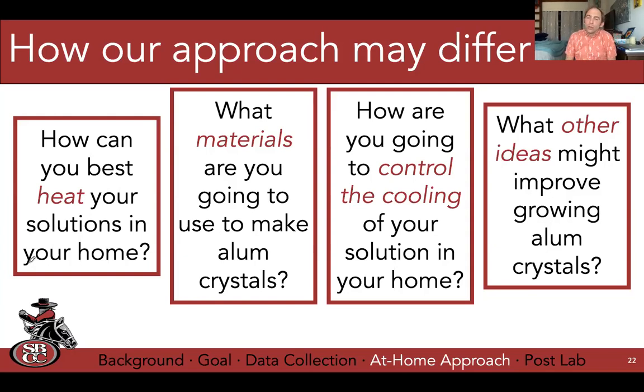How are you going to control the cooling of the solution? I came up with a ton of ideas for this and I tried a lot of them and so many of them didn't work. But I had so much fun. A towel is the beginning. I mean, using a towel is one thing.